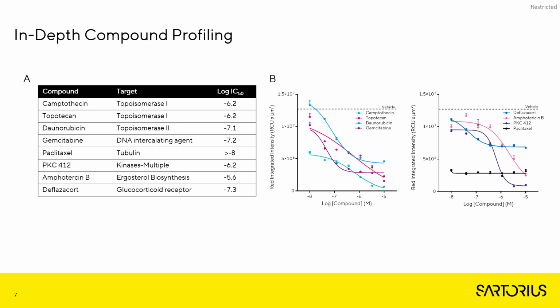Deflazacort, targeting the glucocorticoid receptor, showed a partial effect on viability and was not initially identified as a hit for that parameter. Interestingly, 23 glucocorticoid-interacting compounds were highlighted as active for the spheroid size parameters. Paclitaxel, targeting tubulin, was highly potent at all concentrations tested.